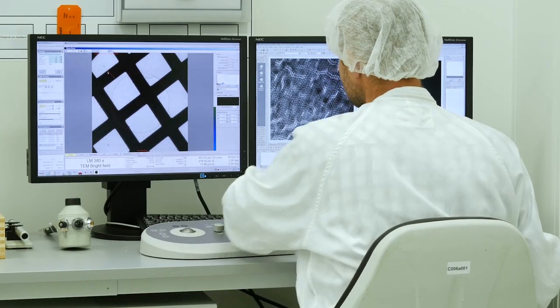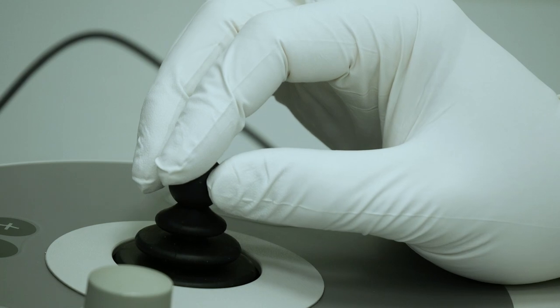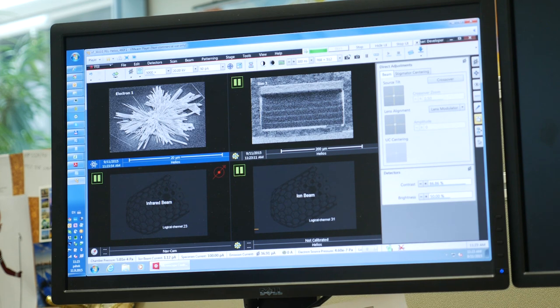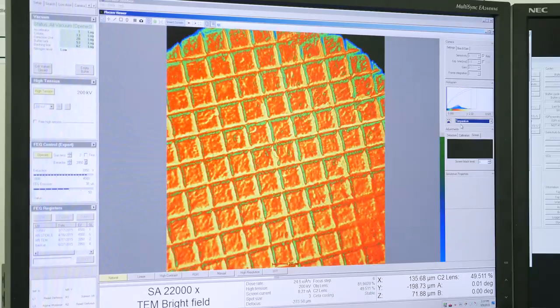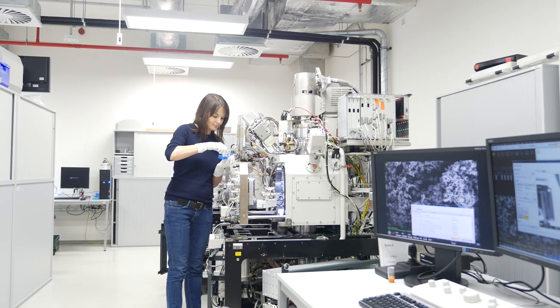Apart from controlling the computer and its operation, the software has another important function: communication with the user through the user interface. The image obtained with the detectors in the microscope chamber is projected on the screen. So is it possible to watch the sample in different ways, depending on the microscope setup? Yes, and it is the software which makes it possible to find the optimal conditions for a particular purpose. And not only that, a customer can use applications that speed up and facilitate work, both in research and development and in industry. For example, 3D reconstruction, analysis of structure, composition, and form.